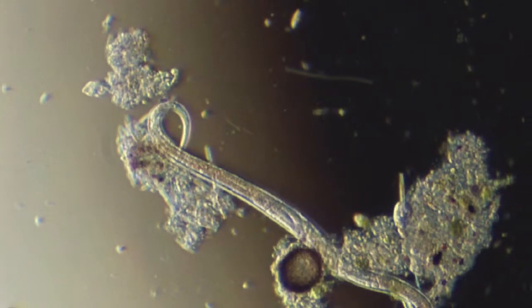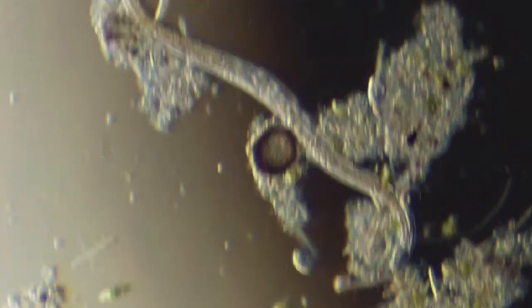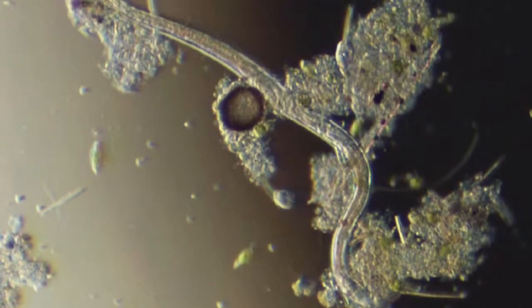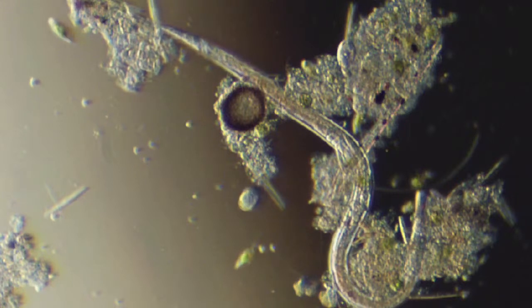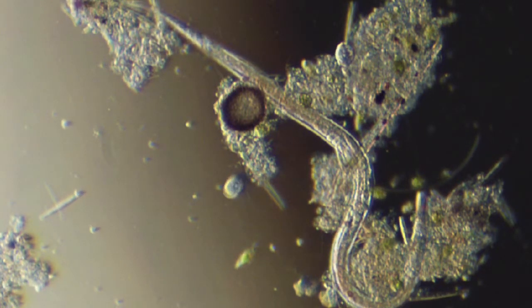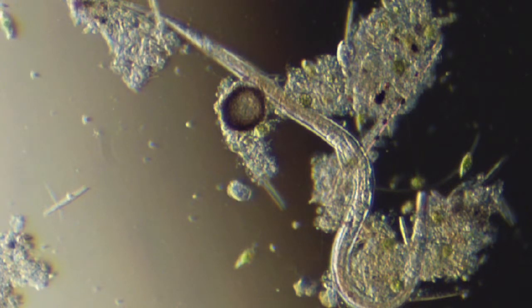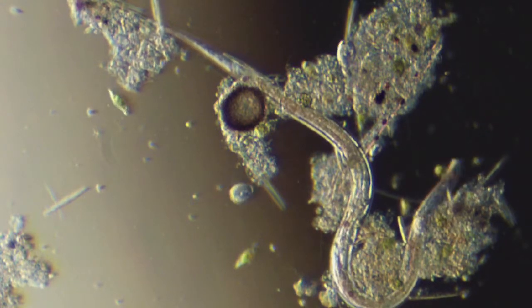So they just squeeze through material effortlessly. Oops, move too fast. So their body motion really suits them for going through all this muck. And they can just turn quickly and go a different direction. So when they're slow and controlled like this, you totally understand it. When they're all flapping around all crazy like that, you just think they're having a tantrum.